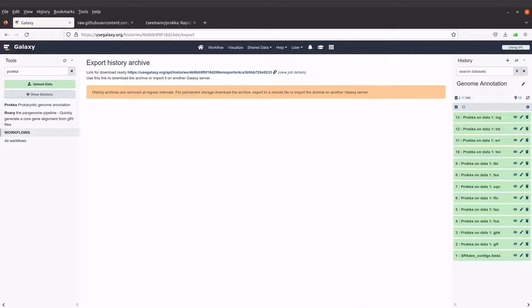So we are back to the Galaxy platform. This was a quick introduction to the Galaxy platform and how it can be used to perform genome annotation by running the Prokka tool. I also encourage you to watch the videos in this playlist to learn more about the Galaxy platform.